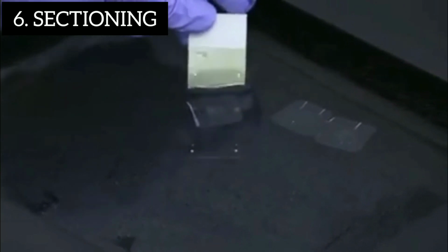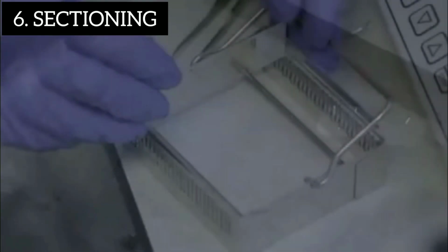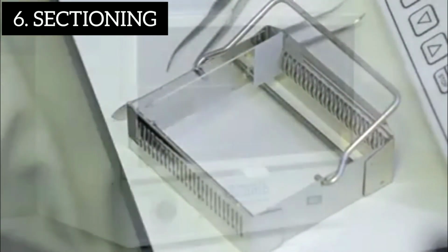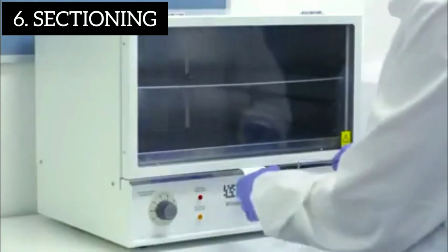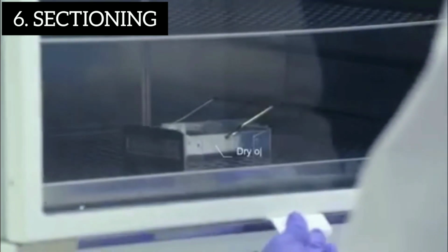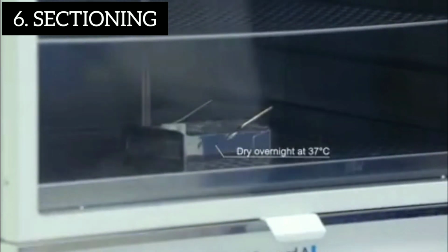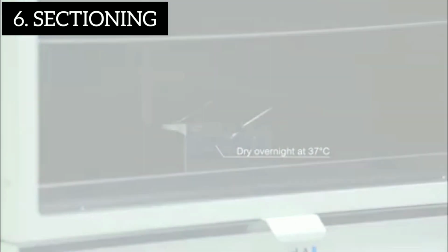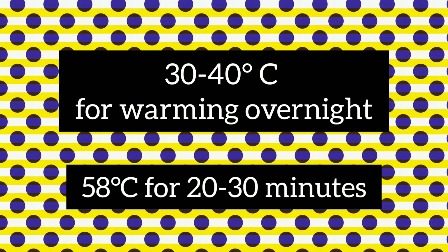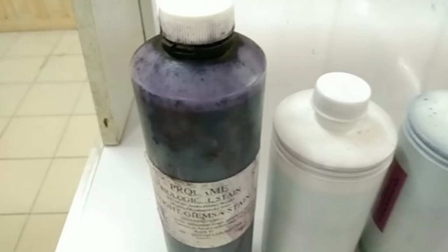Fishing the smoothened tissue is done by submerging the slide into the water bath at approximately 45 degrees angle. After that, the slide dryer is used to hasten the process of heating the slides after fishing the tissue section in a flotation water bath. The warming plate or slide dryer should have a temperature of 37 degrees Celsius to 40 degrees Celsius for warming overnight, or 58 degrees Celsius for 20 to 30 minutes of warming.